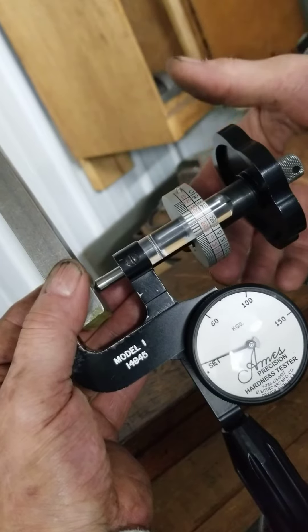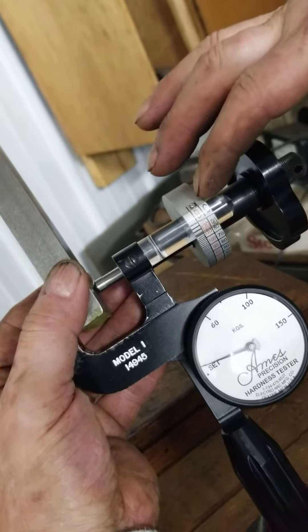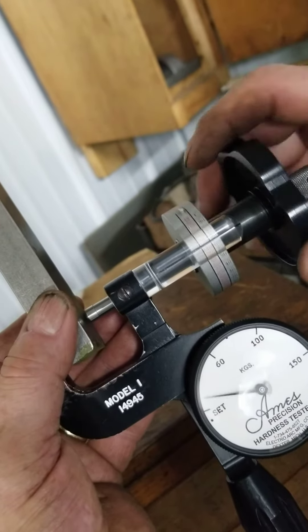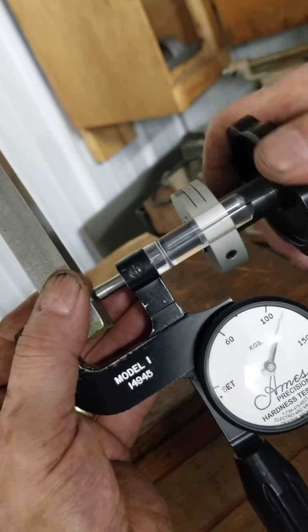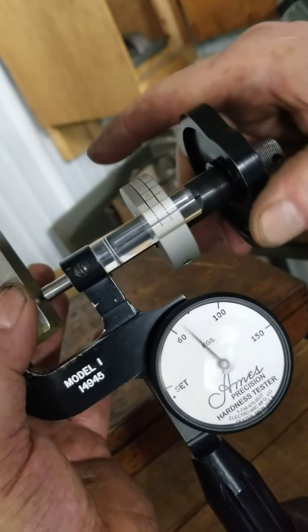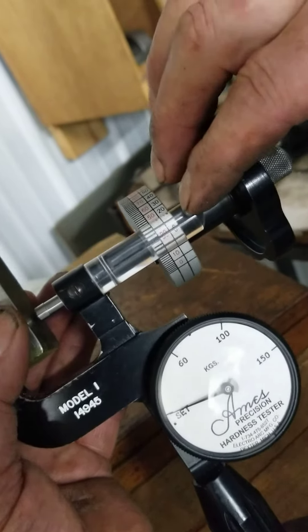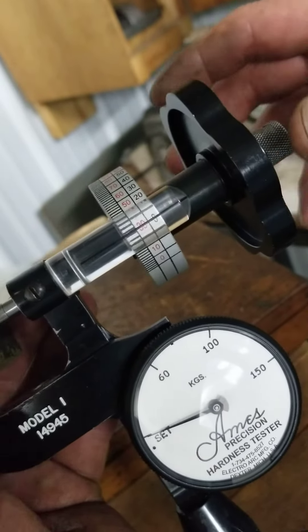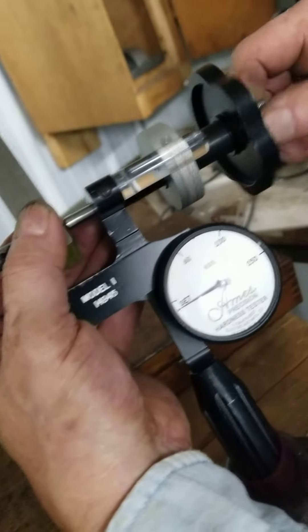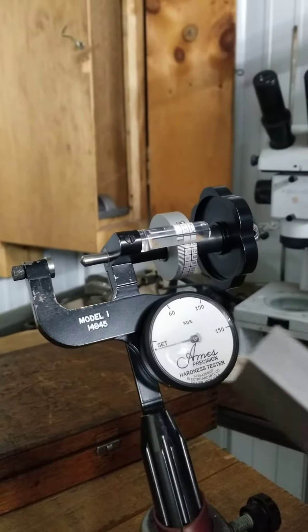You then rotate your dial up to the stop block pin and apply your major load. You then back down to your set line again and take your reading through the magnifying glass. This one was reading about C 18.